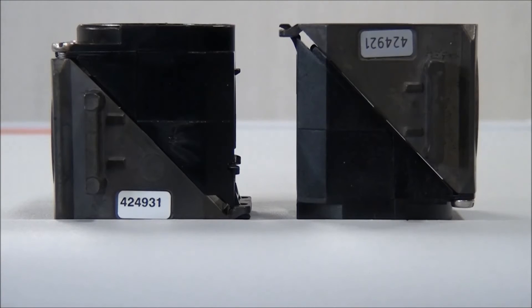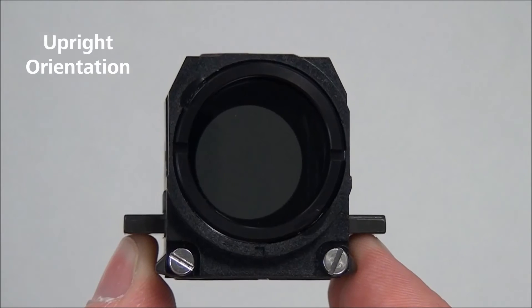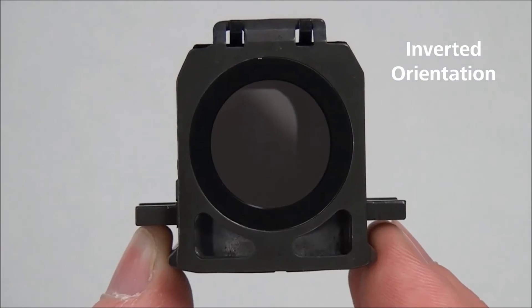To install the reflector module, simply reverse this process. First, make a note of the correct orientation for the reflector module, shown here, before inserting it into the reflector changer. With its wings facing you, grasp the reflector module with your thumb and forefinger.